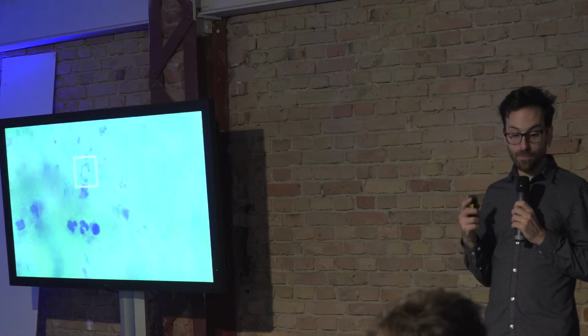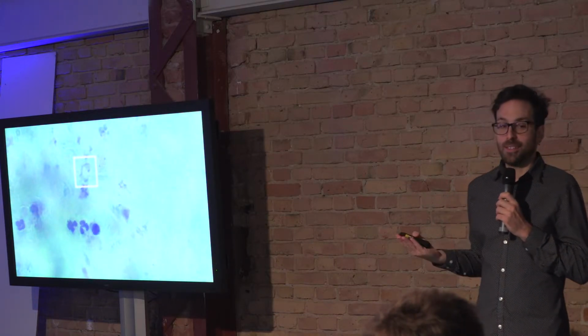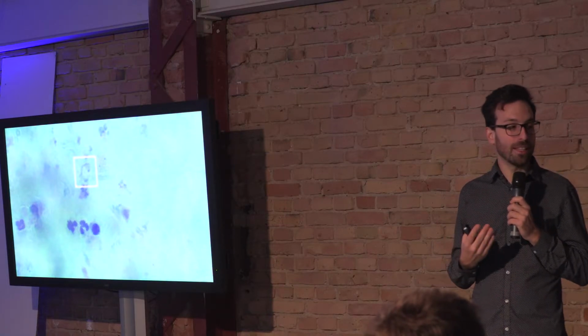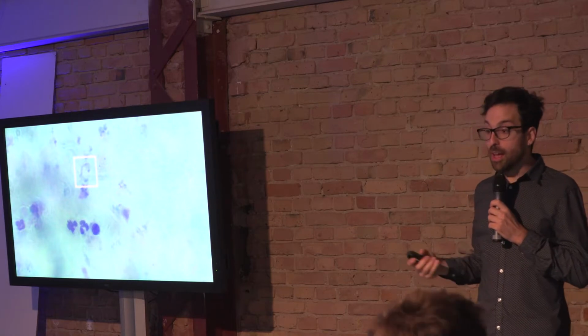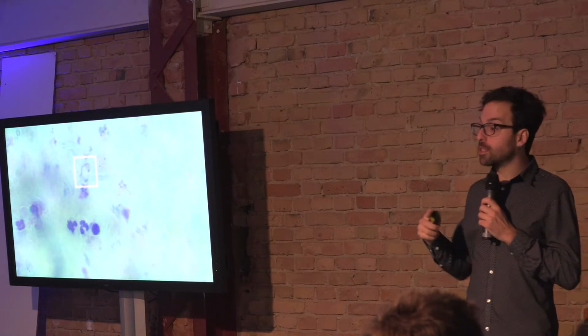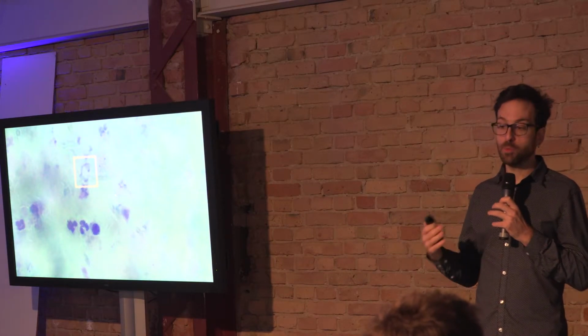For the software, the idea was easy. What came to my mind was, okay, if Facebook can recognize my face, it's stupid not to use that to recognize parasites. It shouldn't be difficult. So I started. What I want to show you is the first version of the software. We have been developing a second version, which is already on GitHub, and we are developing the third one.